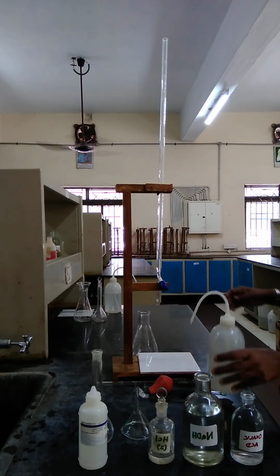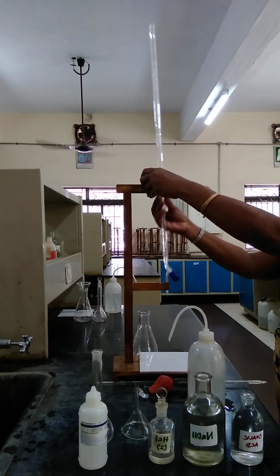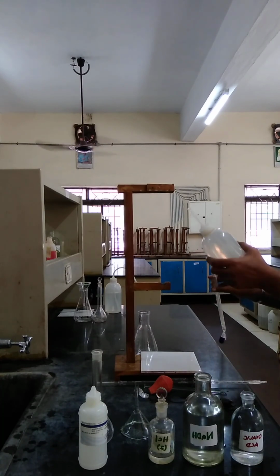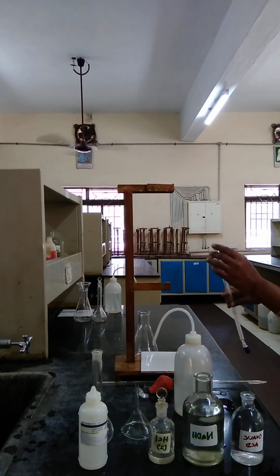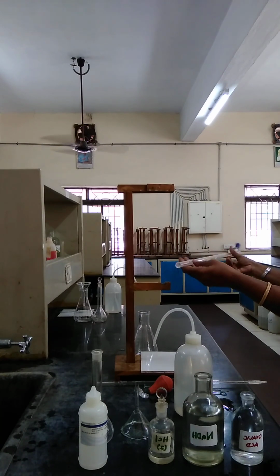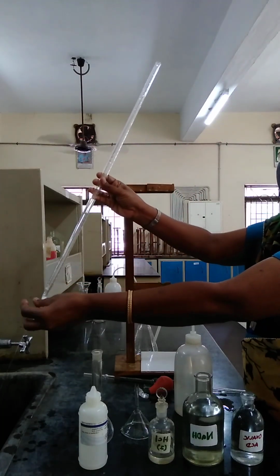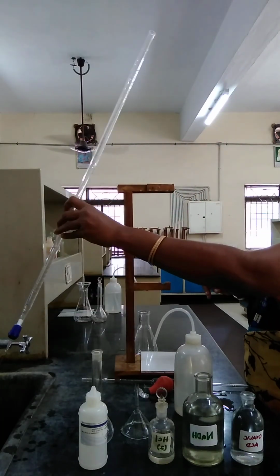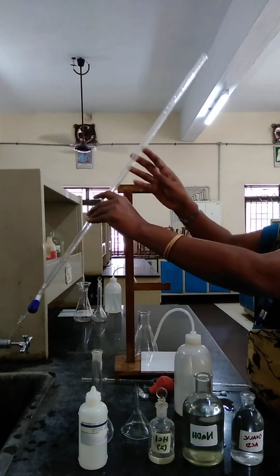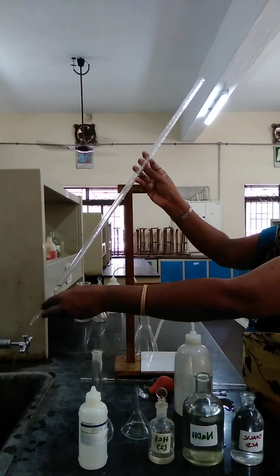So before that, first we have to wash the burette with distilled water, rinse completely. Then we have to rinse with the burette solution, whatever the sodium hydroxide. Okay, so then we have to fill it and keep it ready to do the experiment. Then only you can take the oxalic acid in the pipette. The pipette also you have to wash with distilled water and rinse with the oxalic acid. Then you have to take 20 ml of oxalic acid in the conical flask.